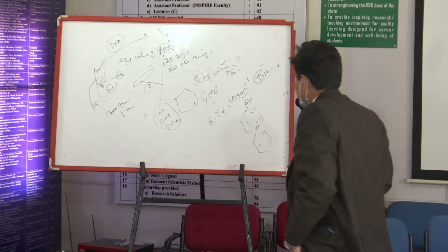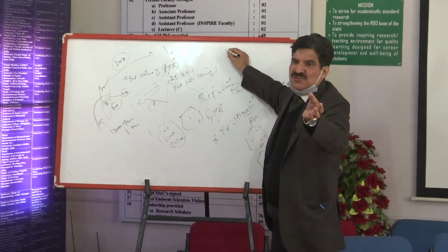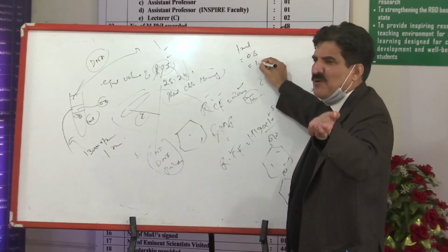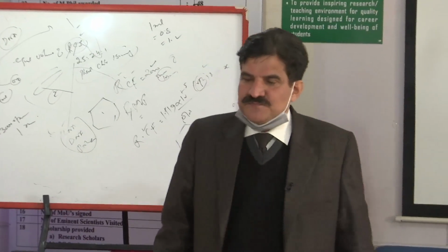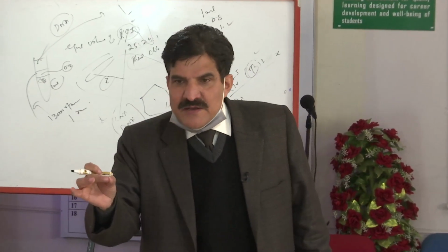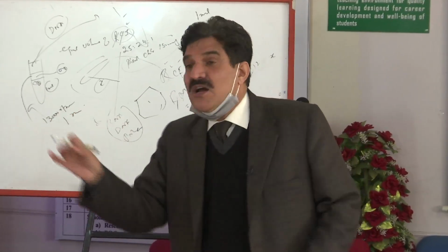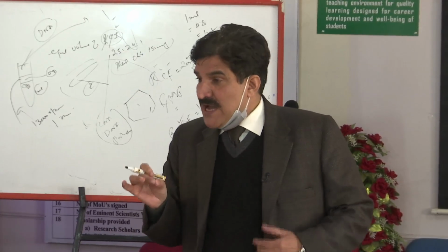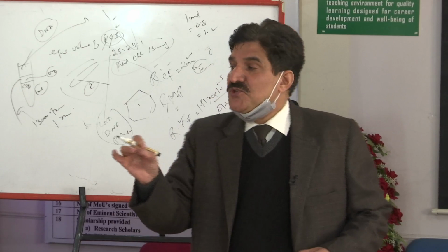So what is to be done? This aqueous phase, how much is it? It may be 1 ml, it may be 0.8 ml, it may be even 1.2 ml. You can take that out and add alcohol to it, or isopropanol to it. Yeah, ethanol. Usually people are using ethanol.